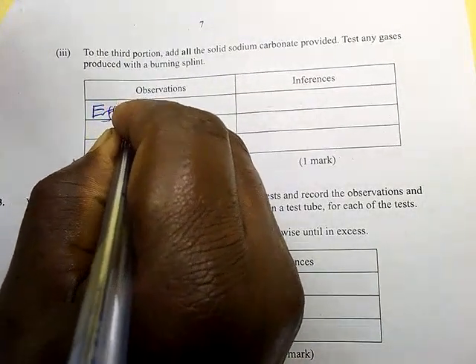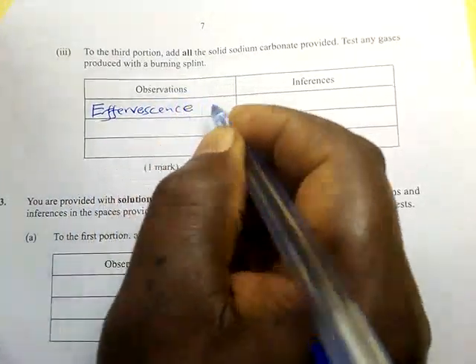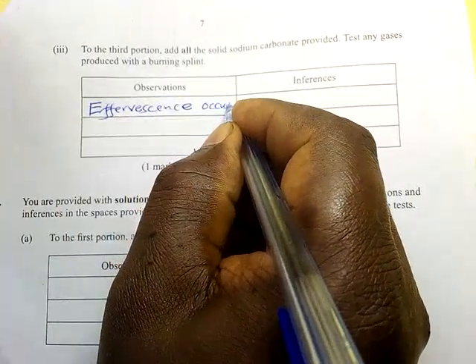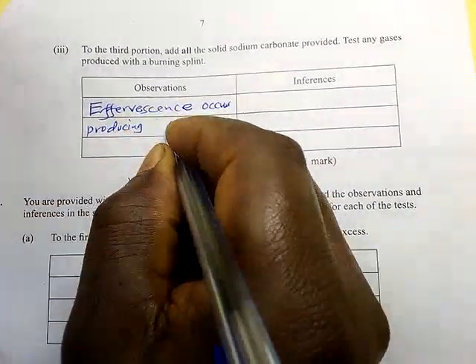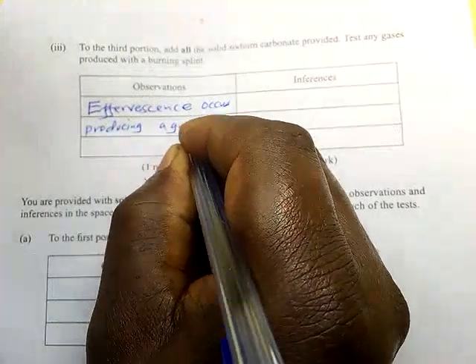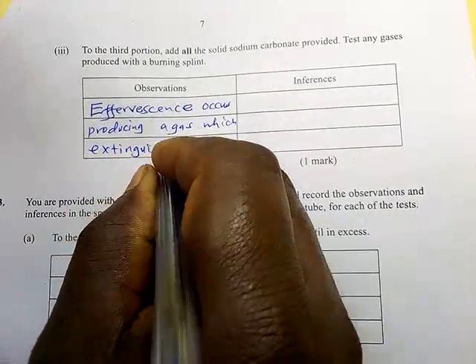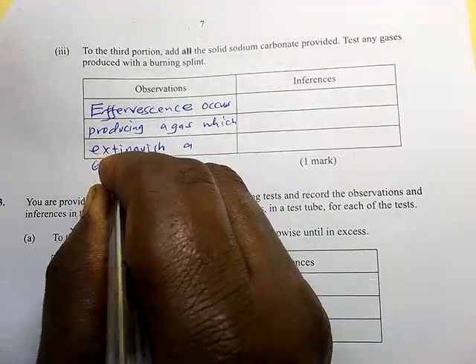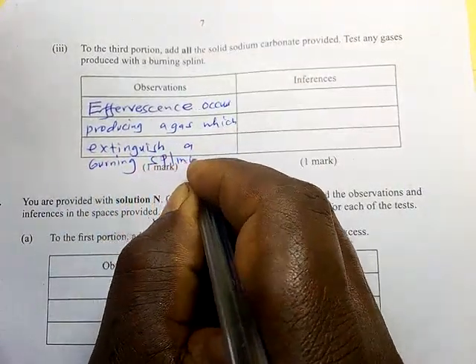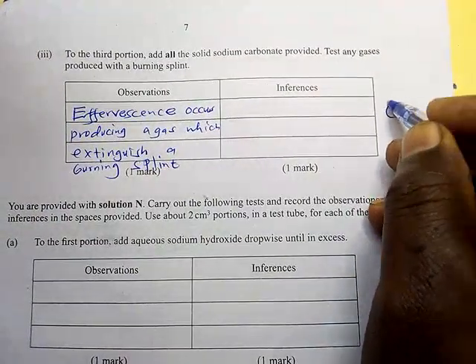Effervescence, producing a gas which extinguishes a burning splint. So it means that carbon dioxide was produced.